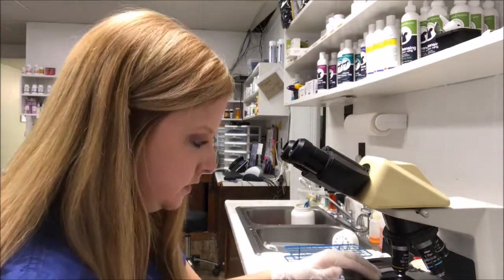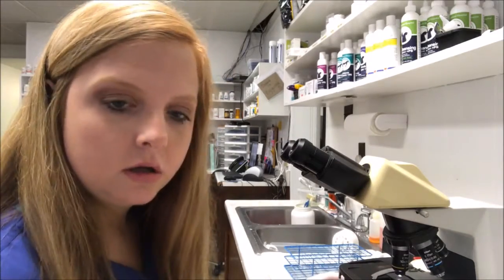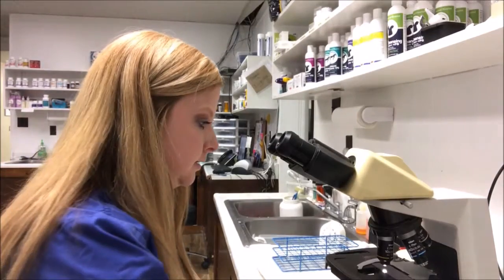So I'm going to first look at this under 10x.